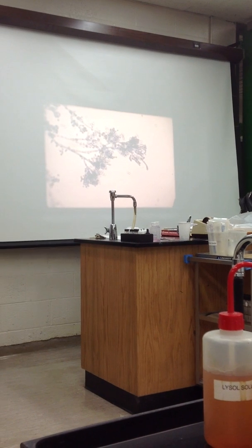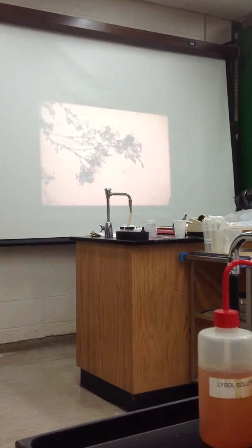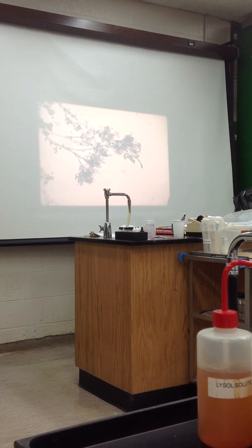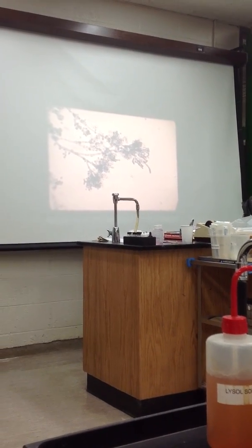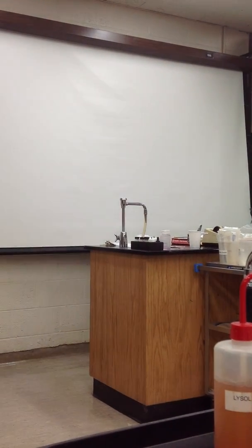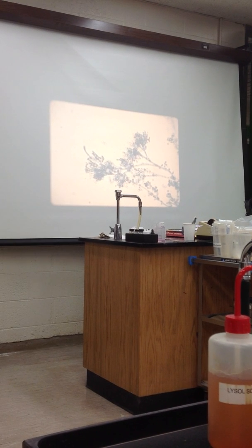I always believe that taking pictures is one thing, drawing it is another. Because when you make your own drawing, sometimes you look at your drawing and go back, and you really know what you're looking at. So, name that fungi there.